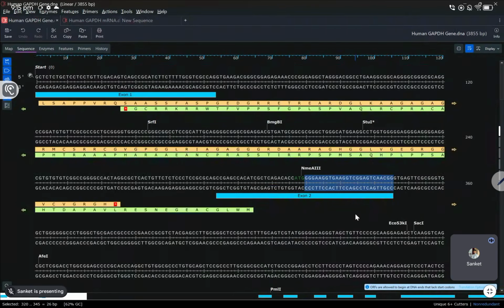But you should also keep in mind that you might not get proper guide RNA in this small sequence. After ATG, this region itself is only 26 bases, and your guide RNA sequence is 20 bases. So you can make yourself more flexible.